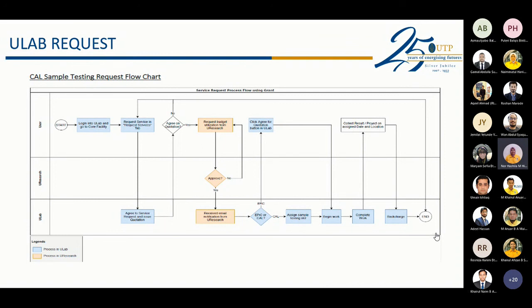Okay, for us, our software is using the ICSD database, which is not really up to date, because we purchased it. We got the database when we bought the equipment, in 2017. So I guess especially the new structures are most probably not available in the database.